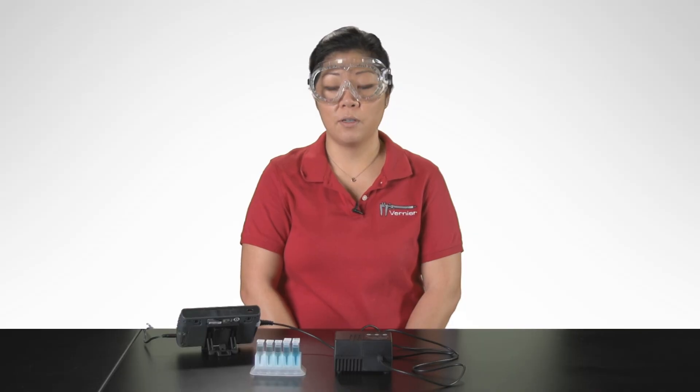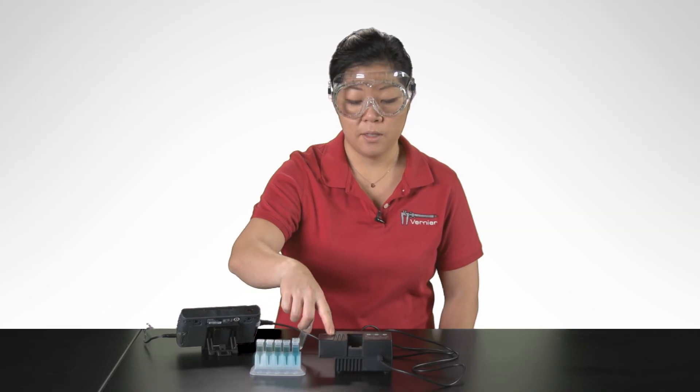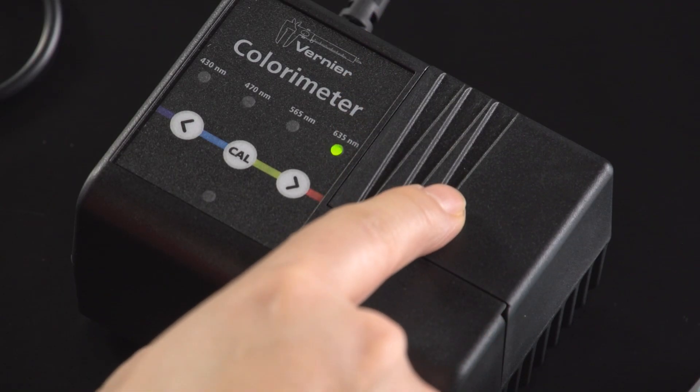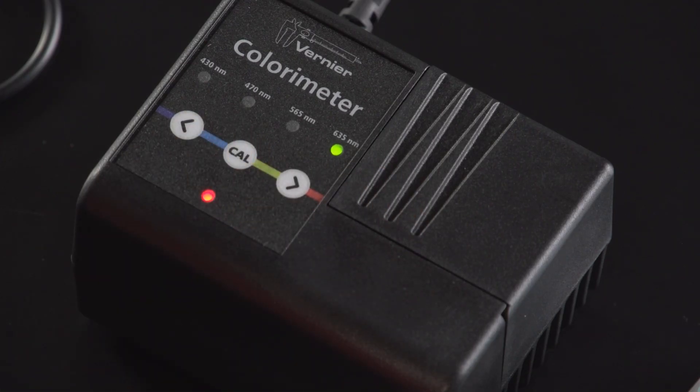To calibrate the colorimeter, insert your blank into the cuvette slot. The blank is distilled water. Press the CAL button. A red light will flash to indicate the colorimeter is calibrating.